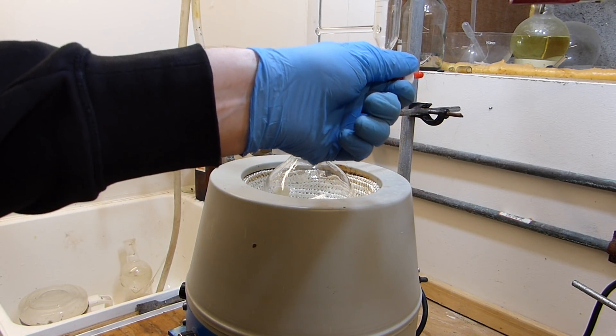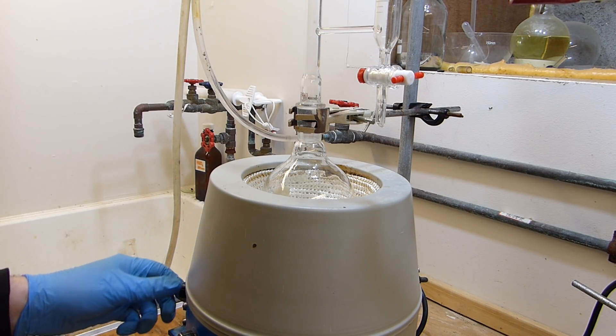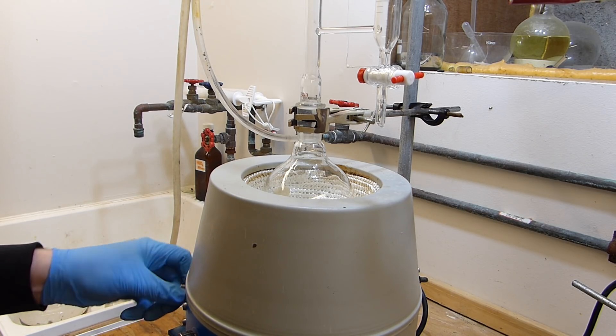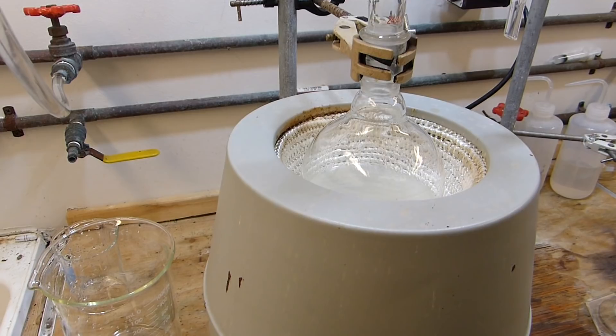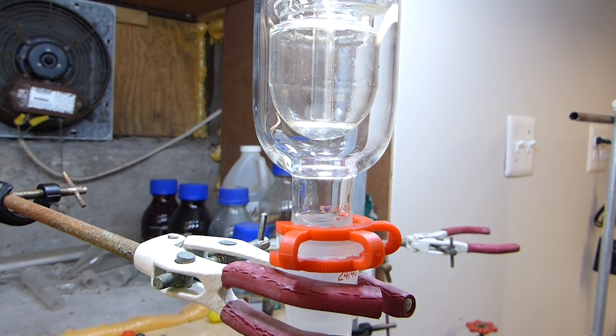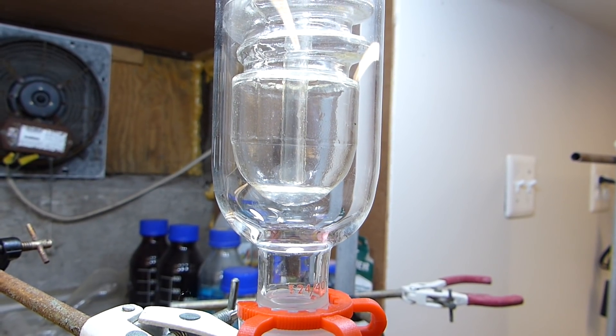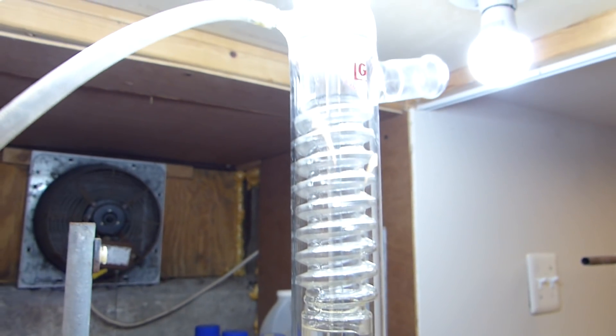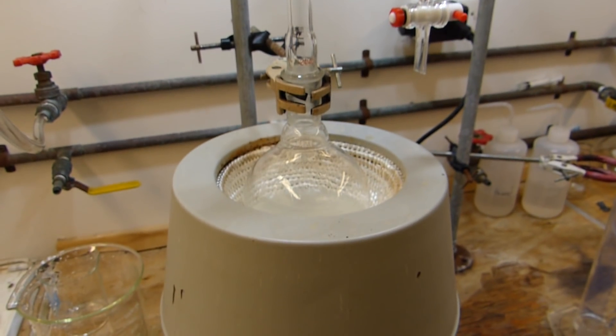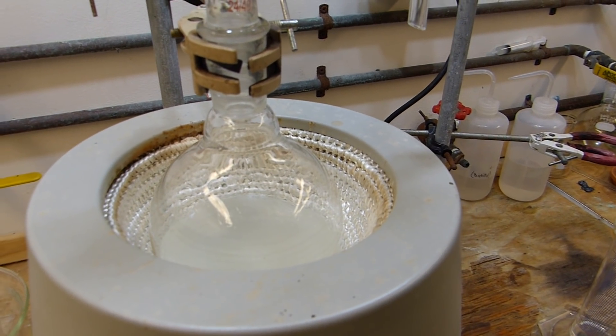Now I'm going to remove this funnel and hook this up to the apparatus and then raise the heating mantle and begin heating. The Dean-Stark stopcock is closed, very important. I'll now turn on the condenser water and that's about a good flow rate. This is all set up and ready to go.